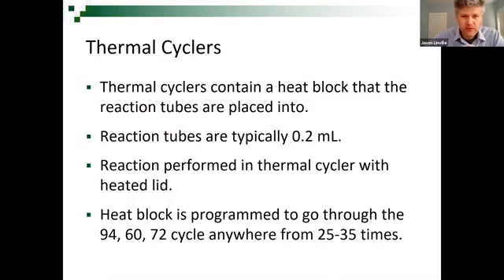Okay, so this just gives you the name and describes what that thermal cycler does, but it's basically to change the temperature. So it's really not that fancy.